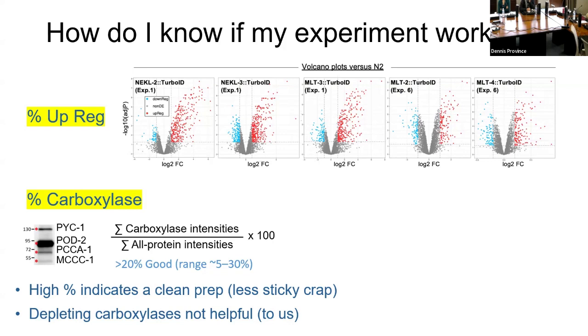Okay, so the other thing I will say is, there are labs that have said we need to get rid of these carboxylases because we'll increase the sensitivity since they'll waste less time. That's never made sense to me because if 75% of the time it's doing the thing I care about, why do I want to go through extra steps? That said, we did go through a bunch of extra steps. It didn't help us at all. Now that may just be us, but if people are obsessed with getting rid of the carboxylases, if you have an easy way to do that, great.